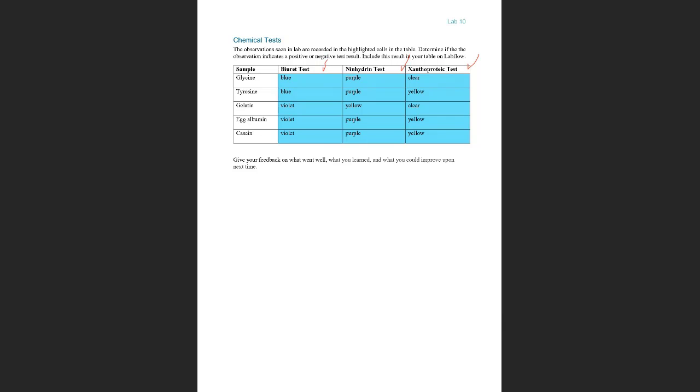So basically, single amino acids or dipeptides will have a negative reaction, but all the others will be positive, and the color will change from the blue of the copper into violet. So in this case, violet is positive and blue is negative.